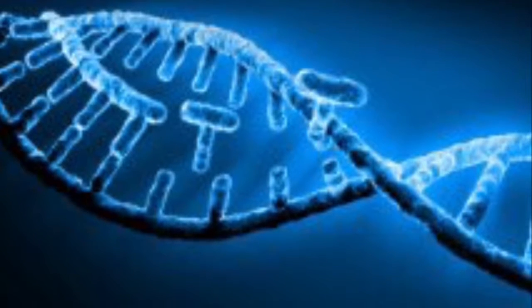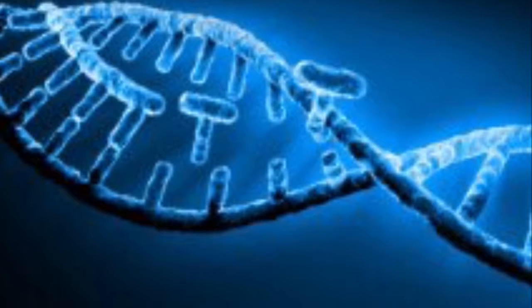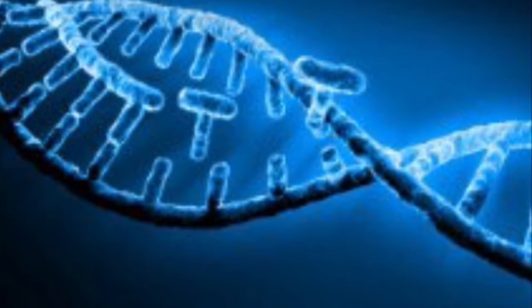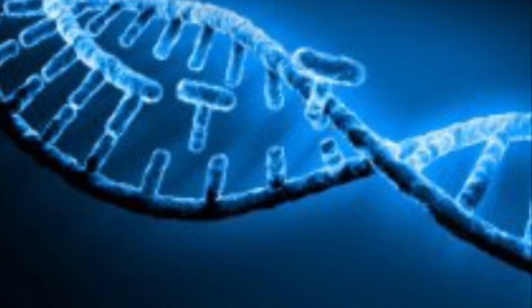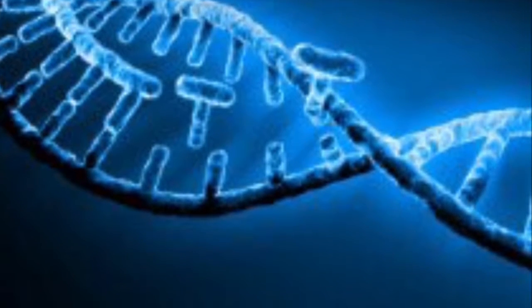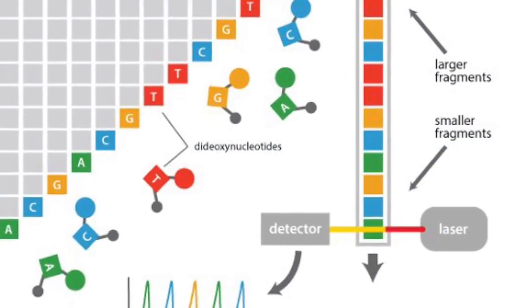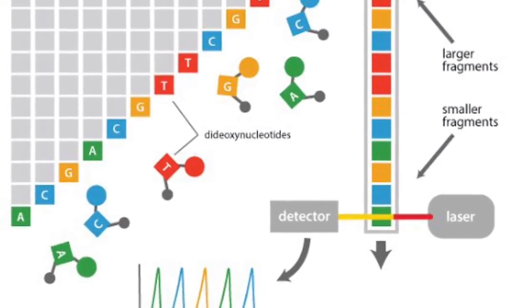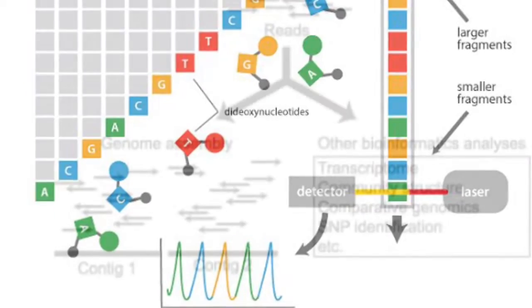Heat again to make the DNA polymerase work. This is going to add random nucleotides until the dideoxy appears. This process is going to occur several times in order to be sure of using all the dideoxynucleotides and get random sizes. This is usually done on individual DNA fragments such as bacterial DNA, plasmids, or DNA copied in the PCR.